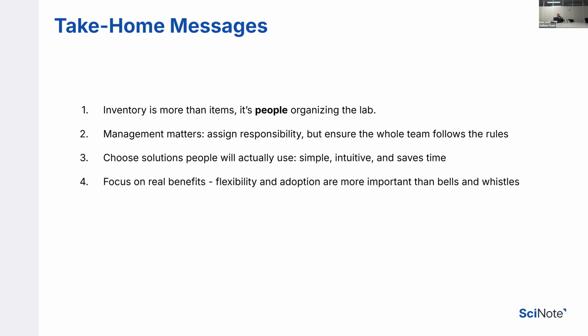Management matters a lot, so you have to assign responsibility. Usually it's not the software that is bad. Most often there were no SOPs written on how the software should be used. The team management failed because nobody enforced the inventory usage or nobody set up the inventory in a way that would help the team.